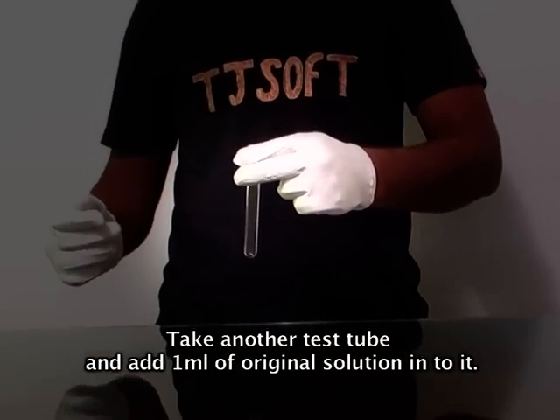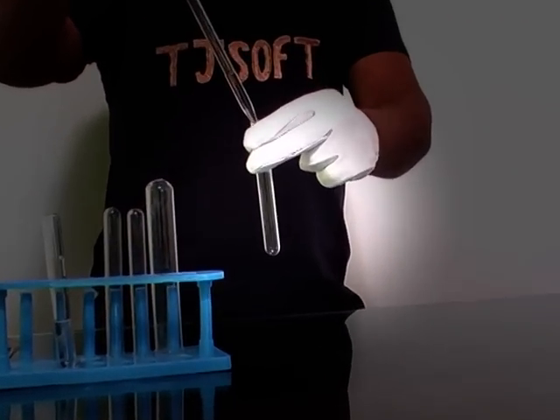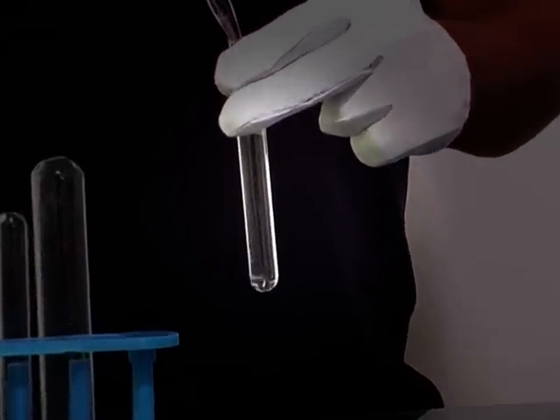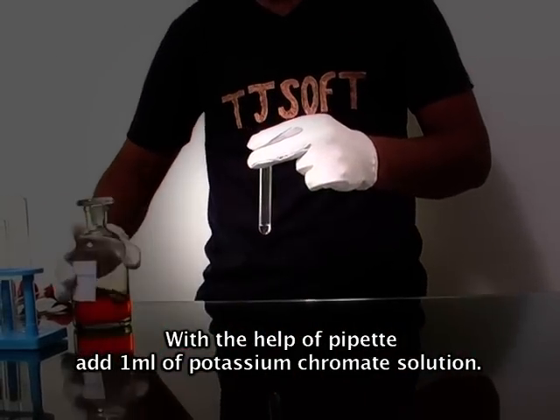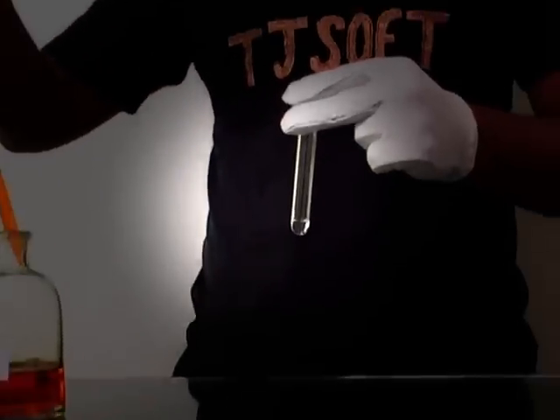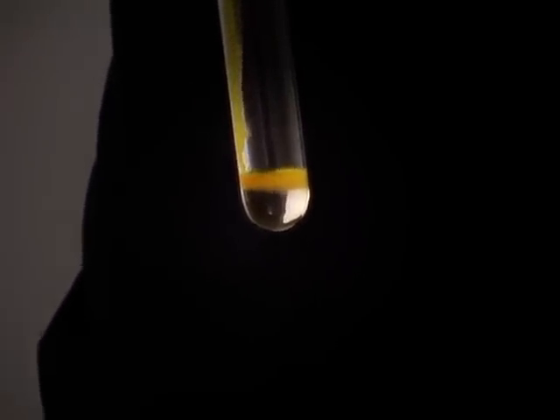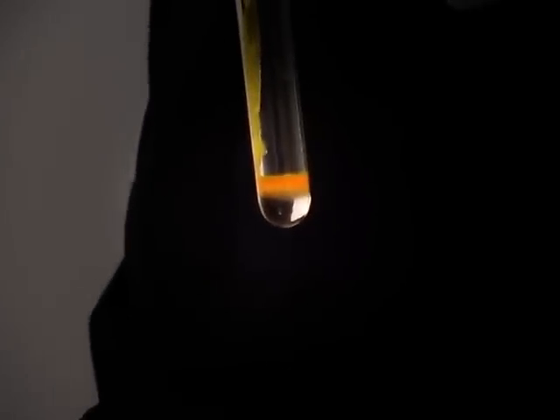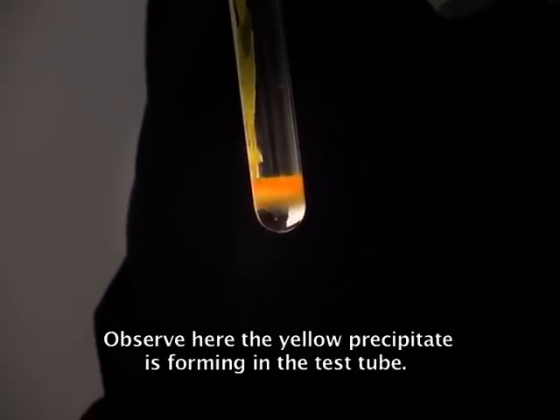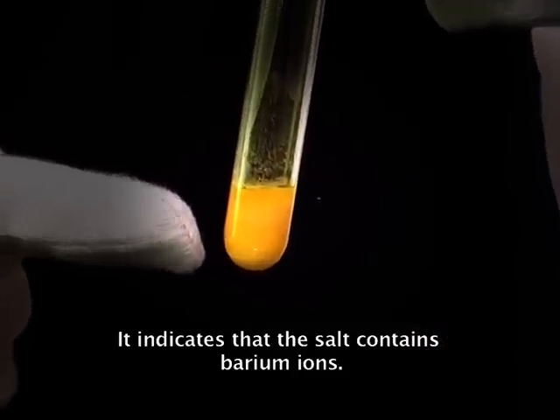Take another test tube and add one ml of original solution into it. With the help of a pipette, add one ml of potassium chromate solution. Observe here — the yellow precipitate is forming in the test tube. This indicates that the salt contains barium ions.